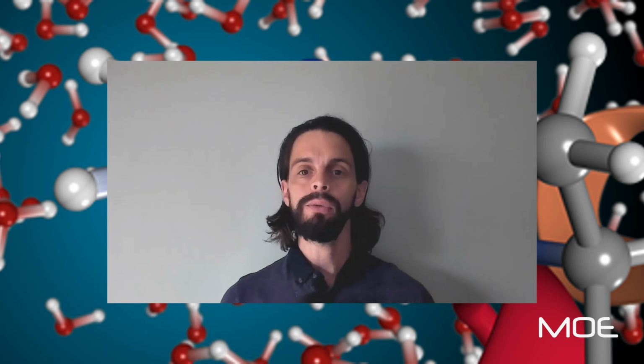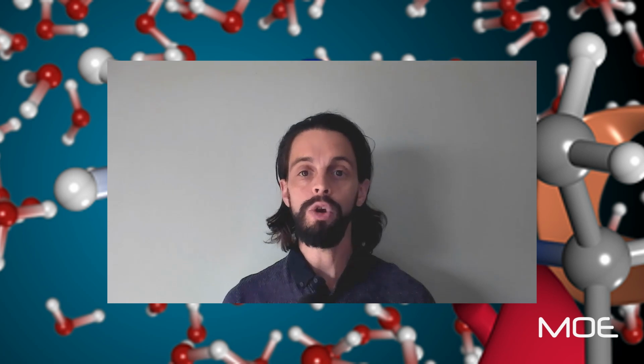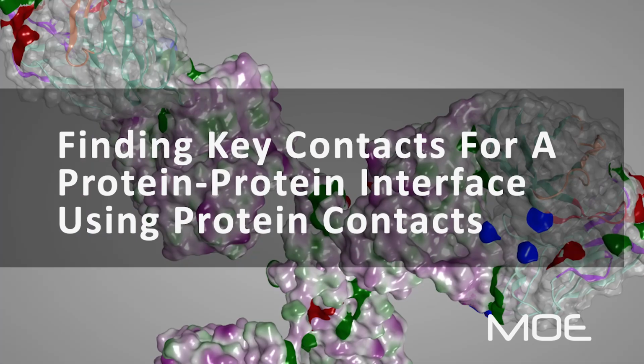Today I'd like to show you how to find key contacts between a protein-protein interface for a specific loop or region or a given residue. So let's get started.